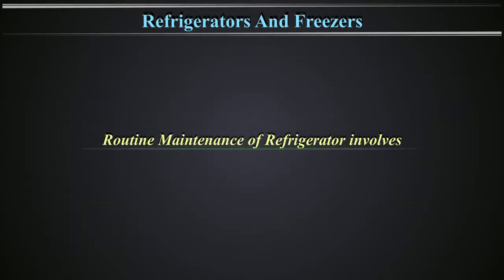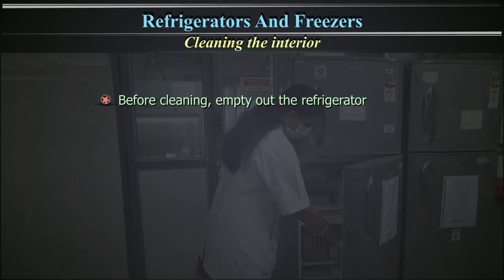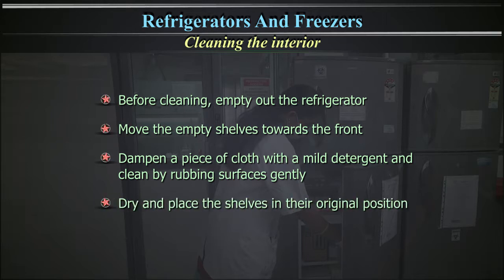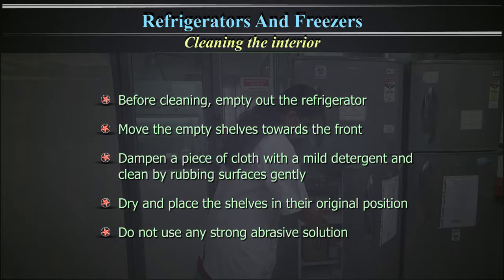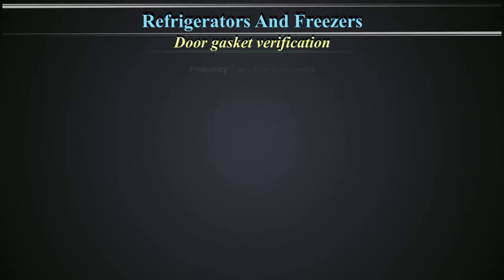Routine maintenance of a refrigerator involves cleaning the interior. Before cleaning, empty out the refrigerator and move the empty shelves towards the front. Dampen a piece of cloth with a mild detergent and clean by rubbing the surfaces gently. Dry and place the shelves in their original position. Do not use any strong abrasive solution. The door gasket verification should be performed every 3 to 6 months.